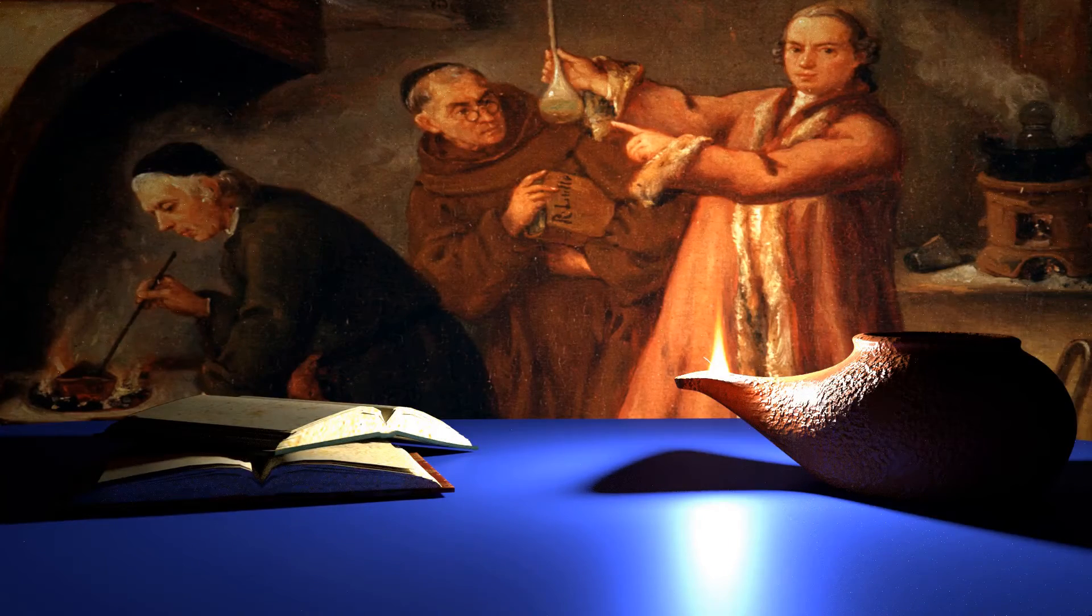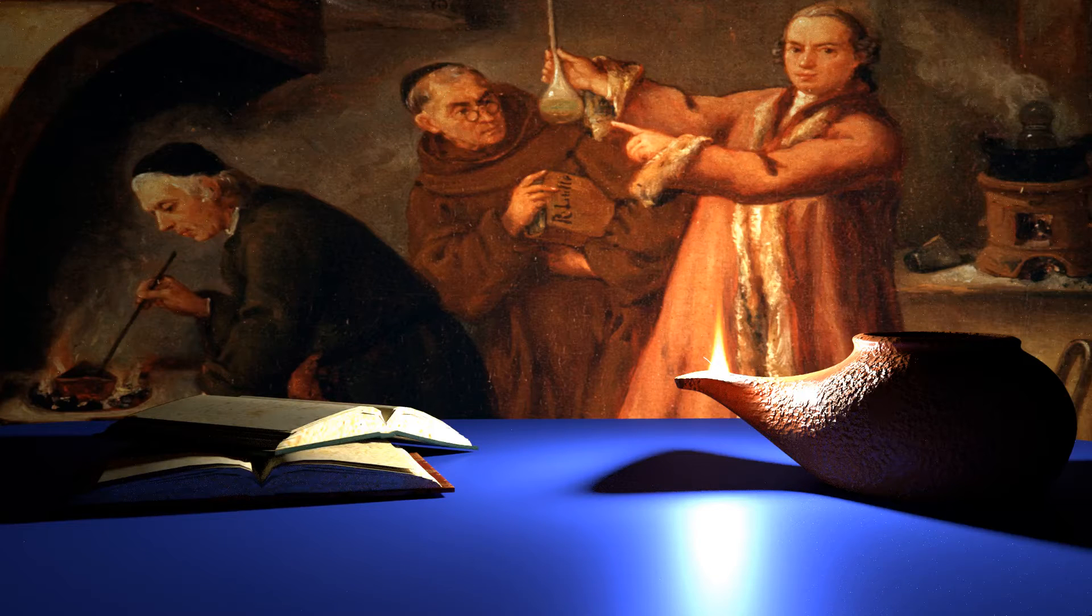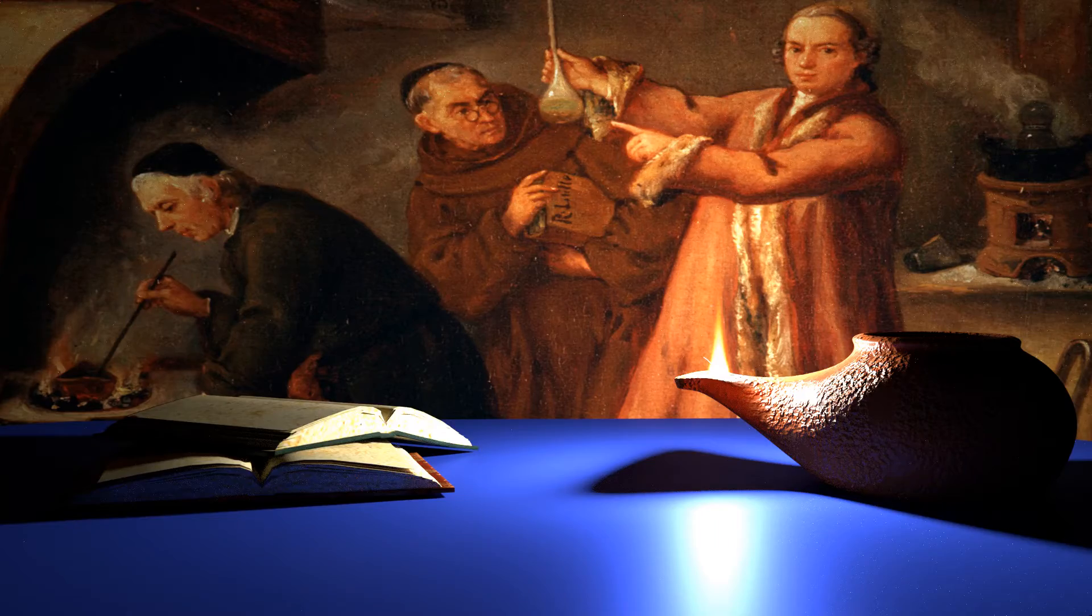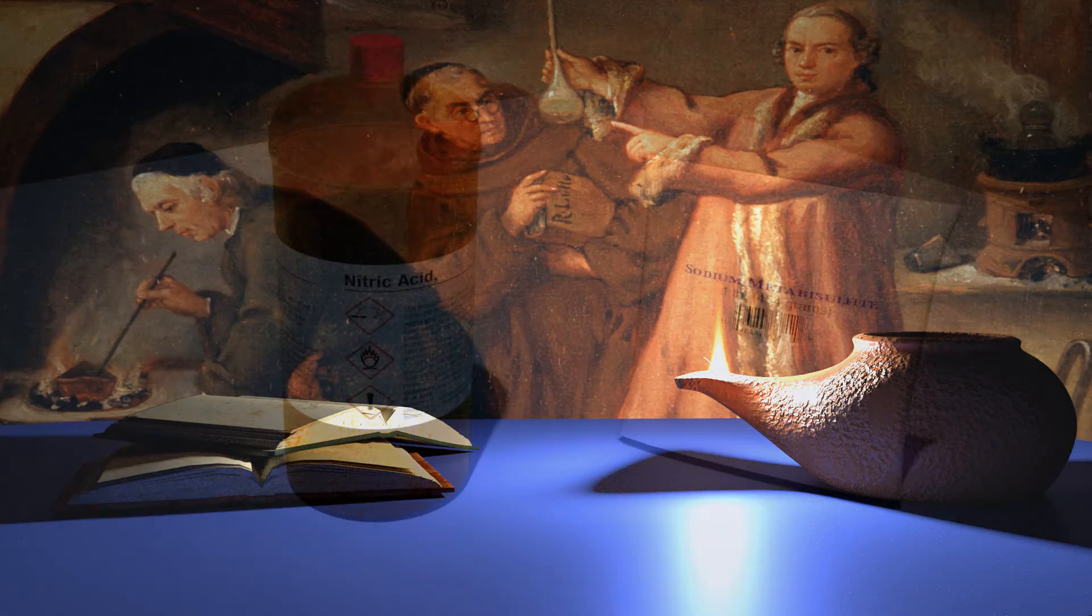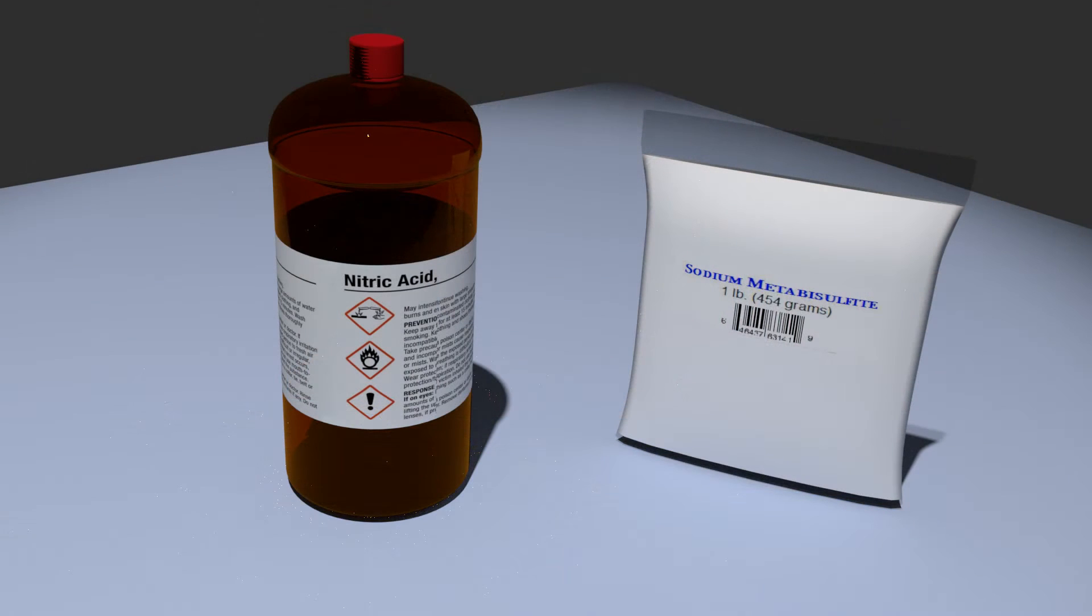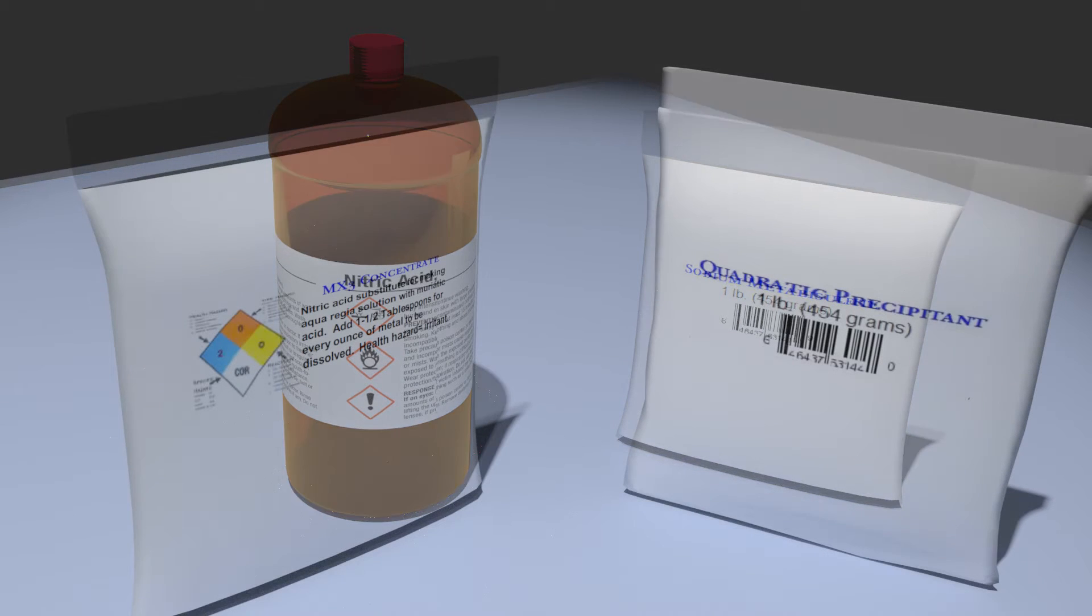The aqua regia process dates back over a thousand years and has traditionally used nitric and hydrochloric acids, as well as toxic and corrosive precipitants. Sure R&D has developed non-toxic, effective substitutes for both nitric acid and the precipitant.